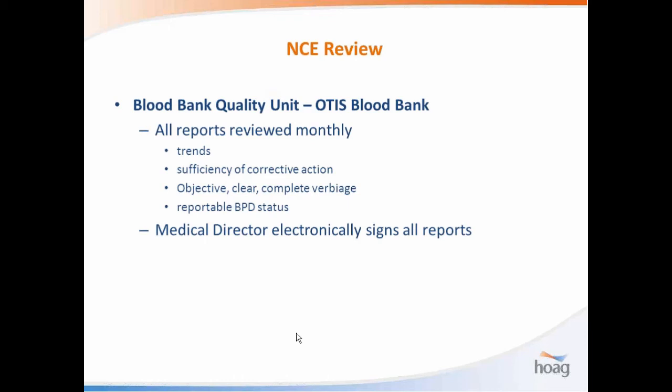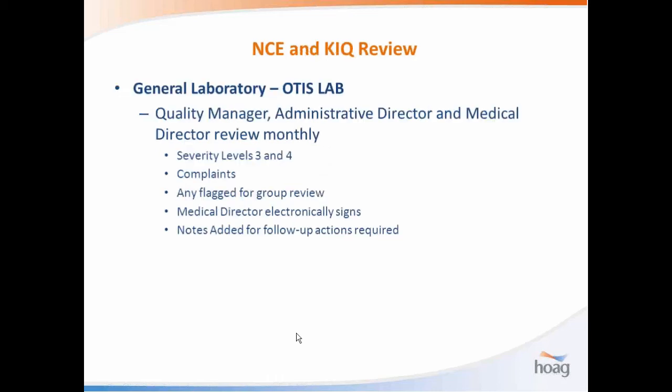And then again, the medical director electronically signs all reports, whereas in the general laboratory ones, she signs only the ones we define for her to sign, which are typically severity level 3s and 4s and complaints.